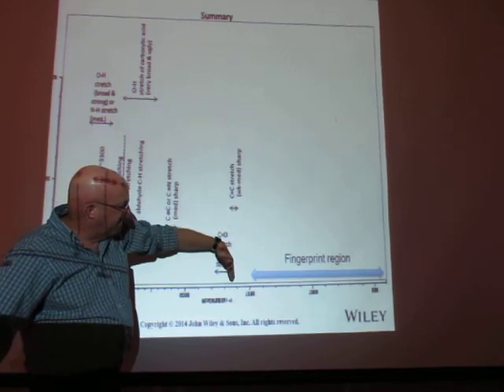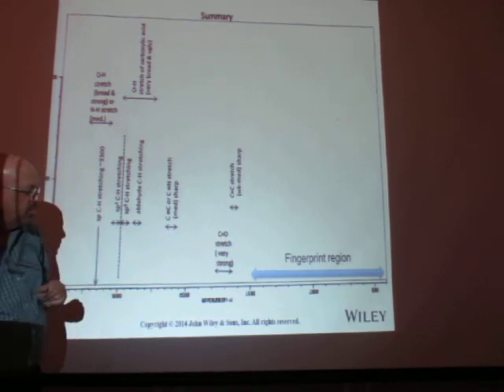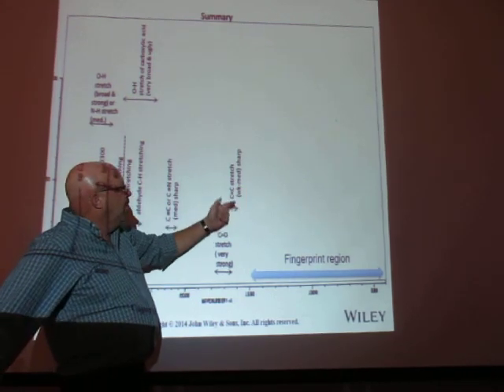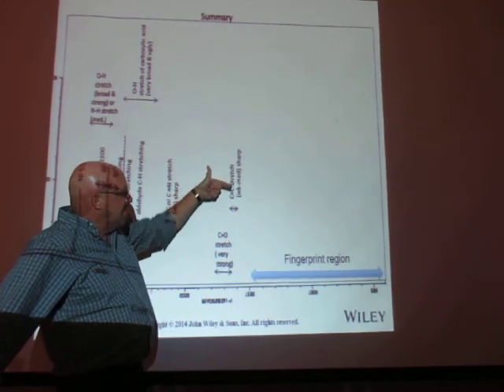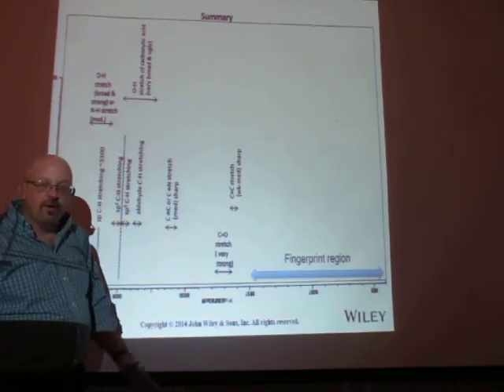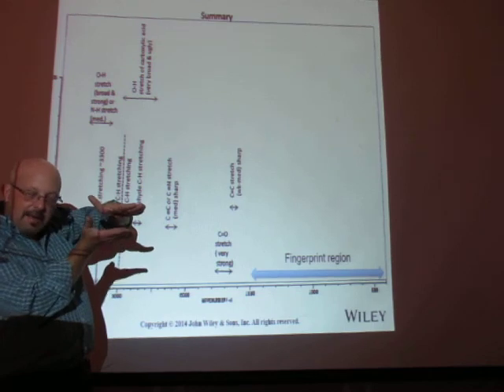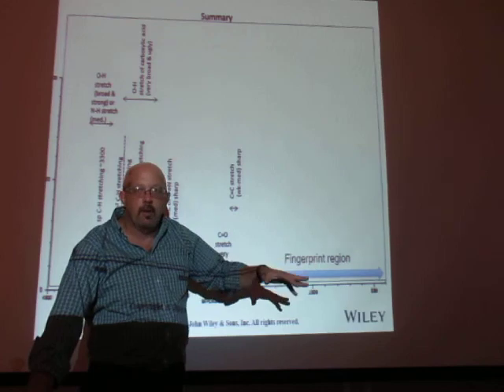Carbonyl, about 1650 to about 1850 or so, is our carbonyl stretch. Always very strong, normally the biggest peak in the spectrum, easy to pick out. A little bit below that, we have carbon-carbon double bond stretch. They're weak to medium intensity, so it's easy to tell the difference between these, because carbonyl is very strong, a big peak. Even though they're pretty close, carbon-carbon double bond is weak to medium intensity, so they're not going to be very big. And then 1500 and below is fingerprint.